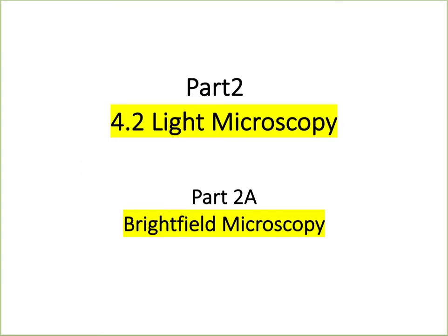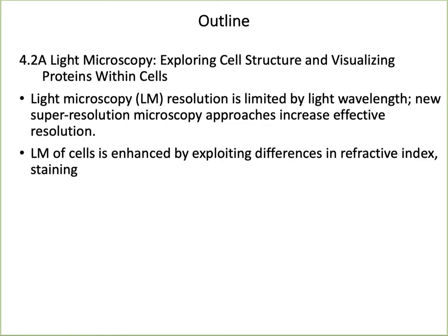Welcome to part 2, which is the light microscopy of chapter 4. In this video, we are going to only cover part 2A, which will be the Brightfield microscopy. And then we will cover part 2B, fluorescence microscopy, which is also under section 4.2. So let's take a look at the outline.